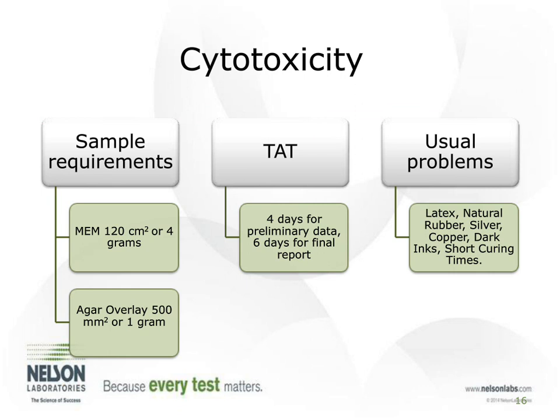But two, it's the cheapest and quickest, and that's because it's an in vitro test. We're using cells that we can grow up really fast. We don't have to order in animals and get them acclimated, and then wait for the animals. We get a quicker response.